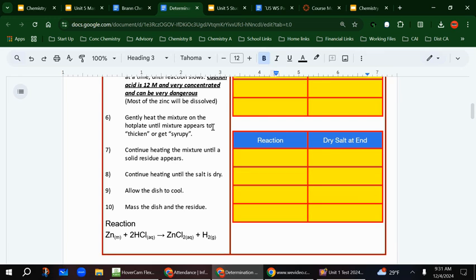While it is cooling, you can turn off your hot plate. You can wipe up the top of your hot plate. As soon as you are done with the acid, I will come over and collect it from your station and get it out of there so no one can get hurt by it. Okay? We will throw out the pipette in the garbage.